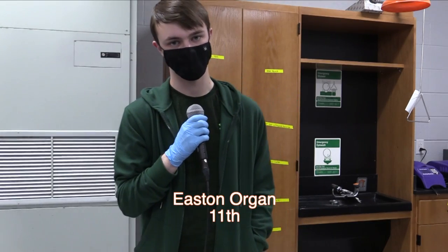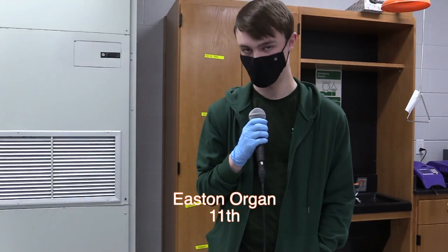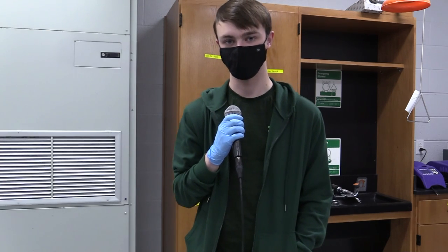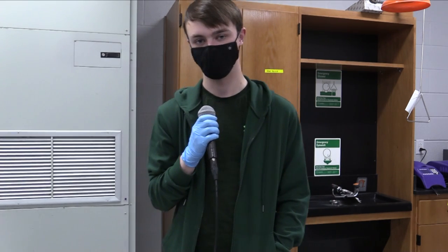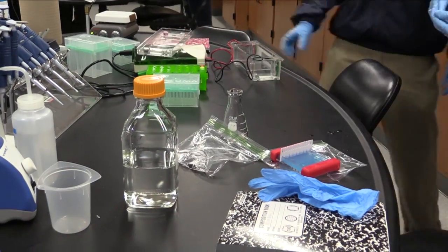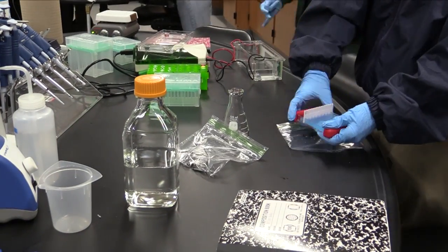So today we're going to be running a TAE buffer through a gel that we have made, and doing this is going to allow us to test three different sources of DNA to compare them and see which three are alike. We know that one is a virus from Missouri, one is a virus from Alabama, and the third is from Louisiana.